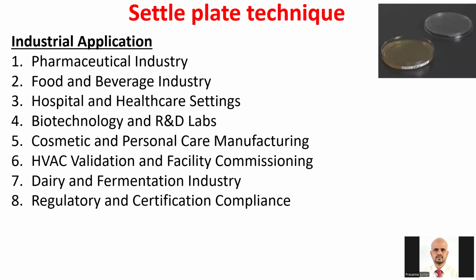Every day they maintain a document of what has been happening, which gives you an idea of how clean your room is. In the food and beverage industry, for quality assurance in processing zones and hazard analysis of critical control points, HACCP, they need the settle plate technique. In hospitals, for infection control and getting an overview of nosocomial infections, they do settle plates to assess bacterial diversity. Even in biotechnology and R&D labs, there are DNA and RNA work zones, and they continuously monitor whether they are maintaining biosafety standards.